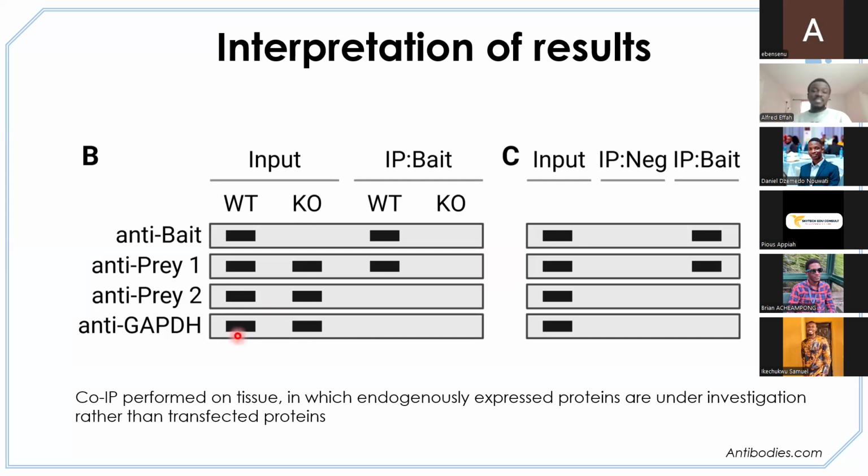So here we stain for GAPDH. You can also stain for beta actin. It is highly expressed under all conditions. You still see beta actin. So you stain for those things to confirm that your steps and everything worked. And if there is any negative or any positive here, it is a true thing and not due to chance.